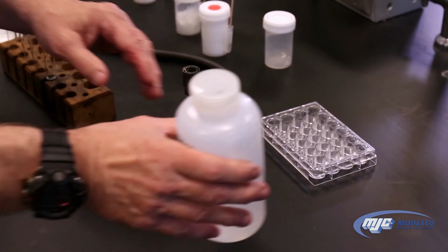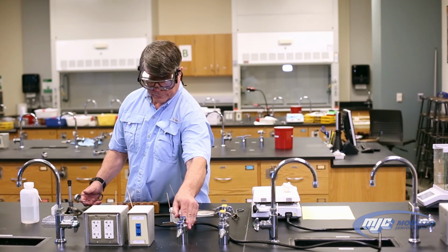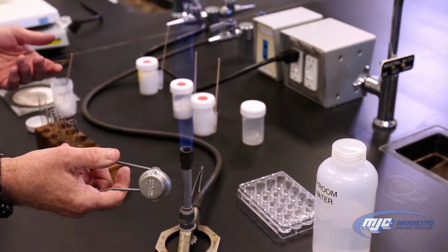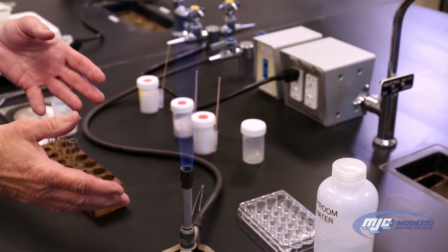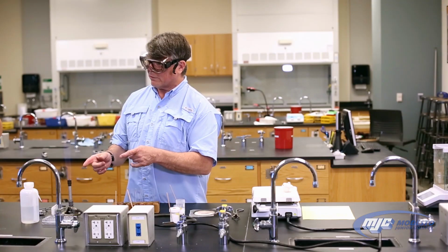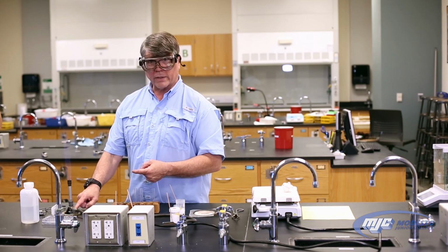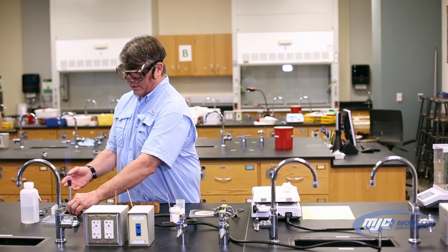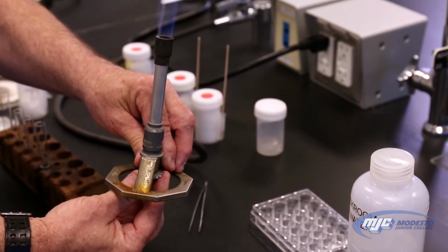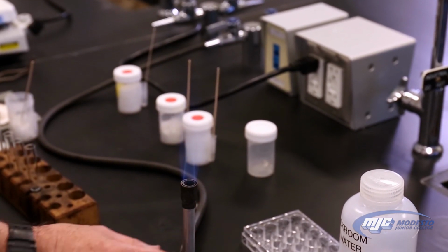We're ready to light the flame. So we've got everything set. Turn on the gas. We can use a lighter or matches. I'm using a striker. And there we go. Now, I can tell I need to adjust that flame. To me, that has too much fuel, maybe not enough oxygen. So the first thing I'm going to do is reduce the amount of fuel that's getting to the flame, and that's that knurled handle, the needle valve on the bottom of the Bunsen burner. It's hot up here, but it's not going to be hot down here. So I'm going to turn this in and get that flame right there. And that's a pretty good flame.